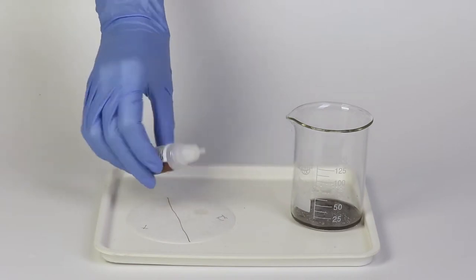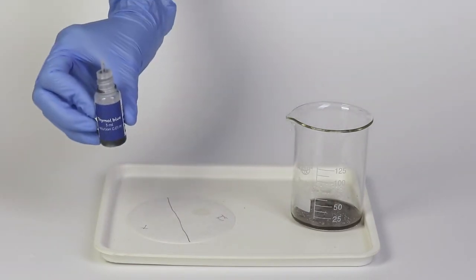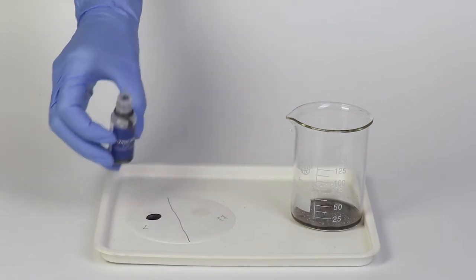Place a drop of potassium iodide on the half labeled KL and a drop of thymol blue on the one labeled T.